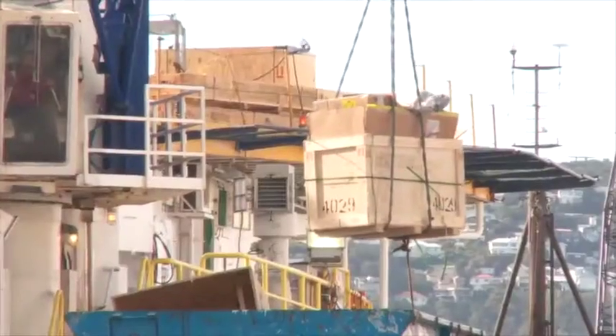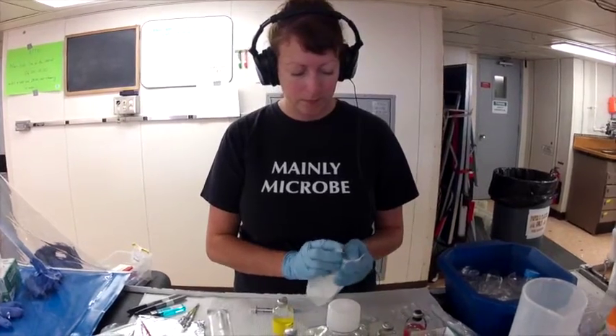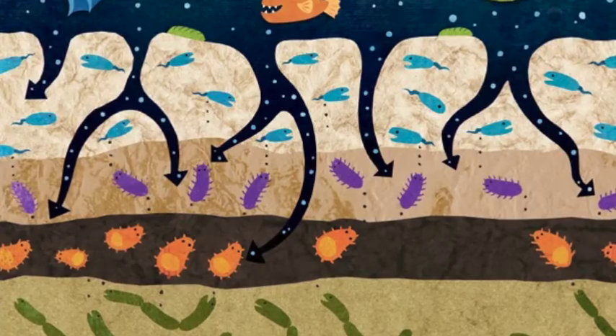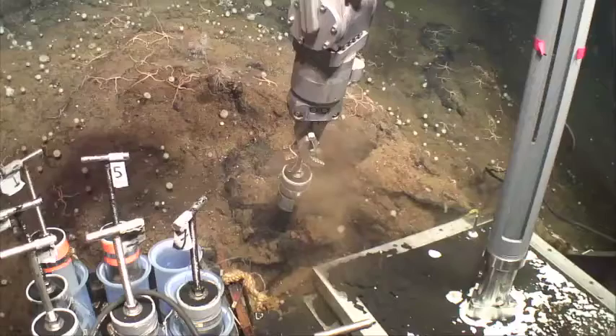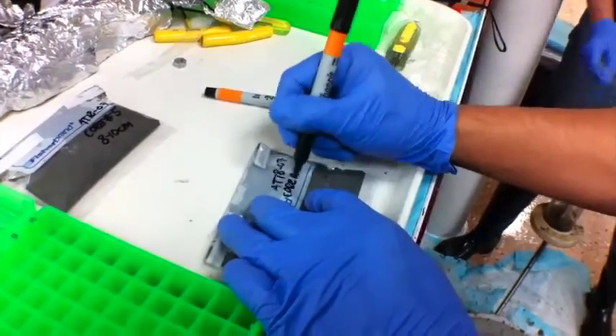Once the seafloor samples are brought to land, it's time to look at them more closely in the laboratory. The microbiologists want to find out what microbes live under the seafloor. They have several ways to do that, depending on the samples. For mud, called sediment, they might look for the microbes with a microscope.